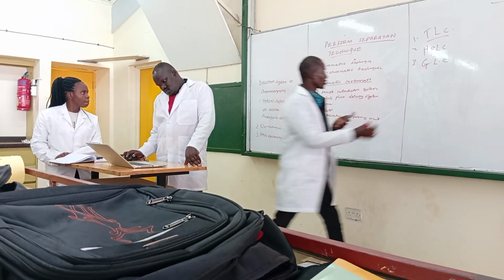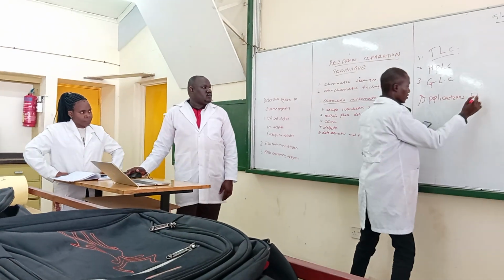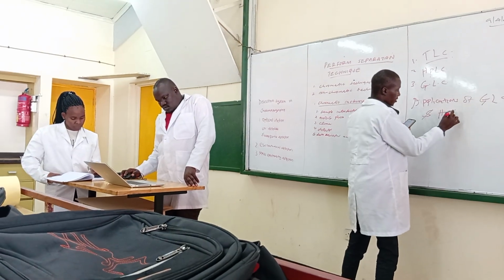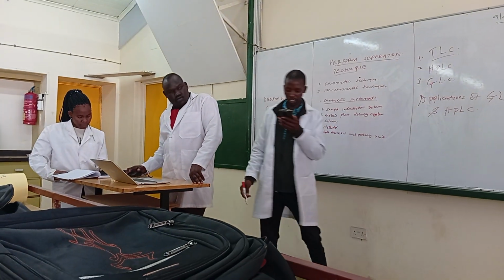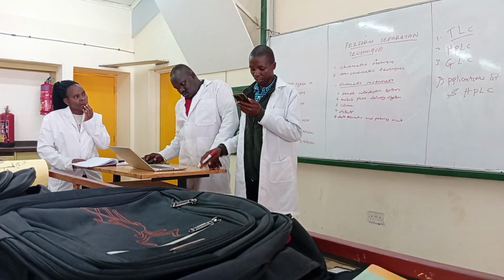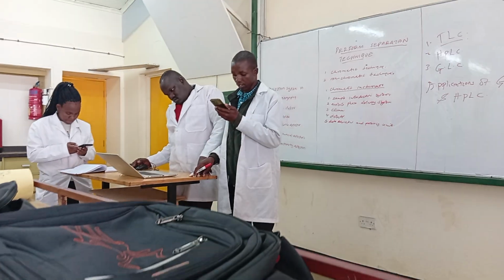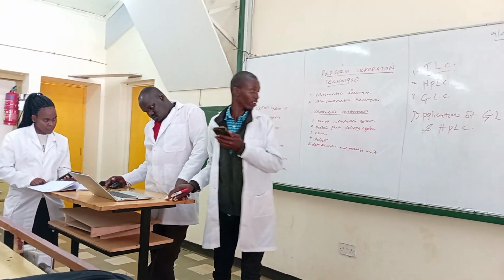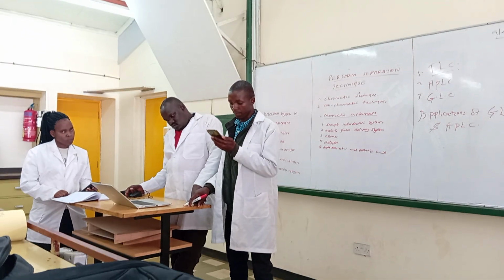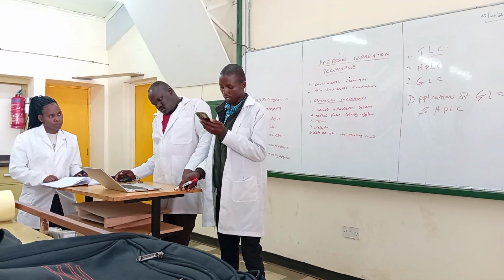And then we have the applications, the applications of GLC and HPLC. For GLC: analyzing fuels, environmental pollutants, volatile organic compounds, and drugs in biological fluids, and testing food and beverage quality. And for HPLC: quantitative analysis of pharmaceuticals, food additives, environmental pollutants, and biological samples.